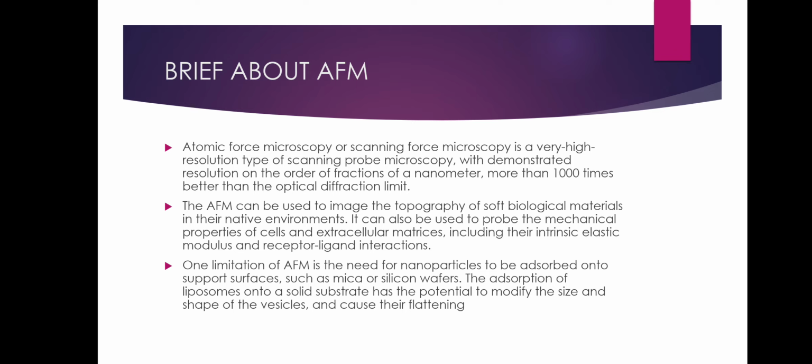The information is gathered by feeling or touching the sample surface with a mechanical probe. The AFM can be used to image the topography of soft biological materials, which means the image formed by using the AFM is in the form of a topography or a 3D image.